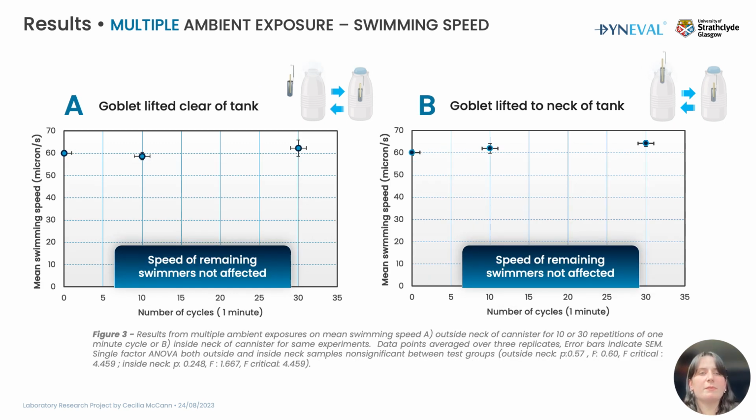And the swimming speed for the multiple ambient exposure experiment: again, the swimming speed doesn't really seem to be impacted by these ambient exposures. It sits between 60 to 65 microns per second, and it's not statistically significant between test groups.